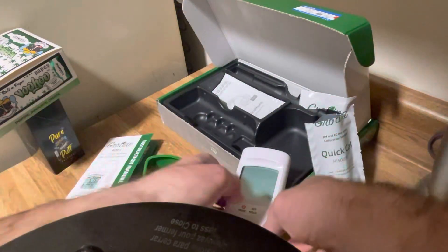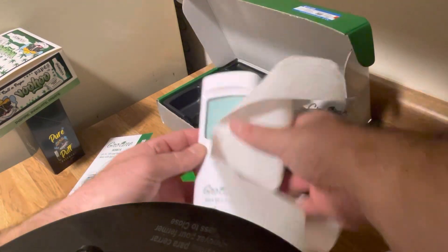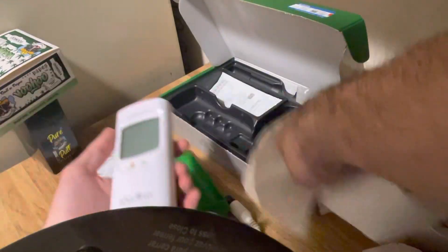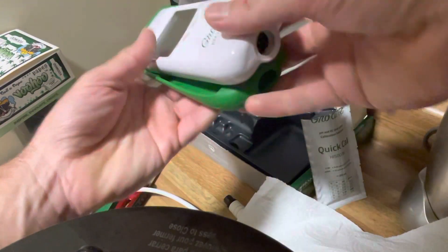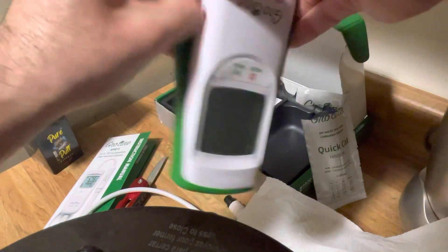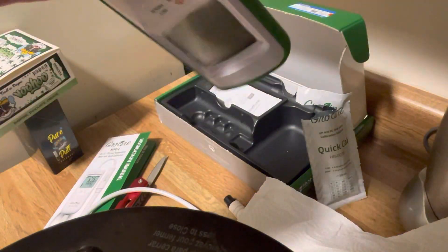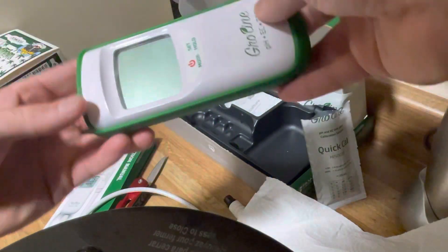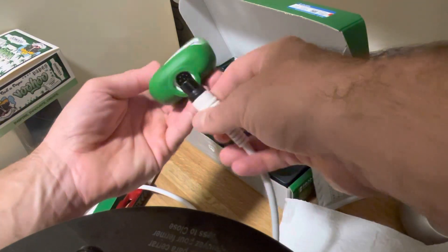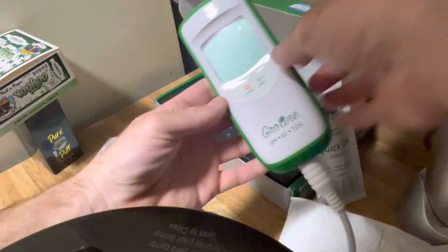I also got this nice little grip and case that Hanna sent me, so I'm going to install that right now. Big shout out to Hanna — the best pH meter company in my opinion. Most reliable, two-year warranty, most affordable products, and the best products. What I like about Hanna is they've been doing meters for years and they help multiple industries — it's not just growers. So they make products you can rely on. There you have it, the Growline HI 9814.